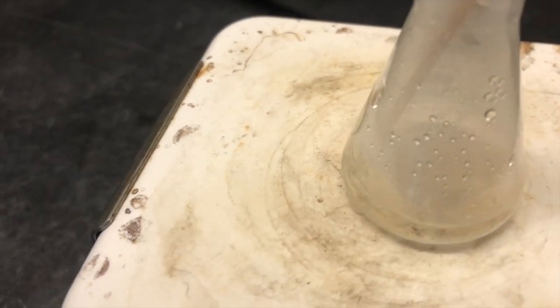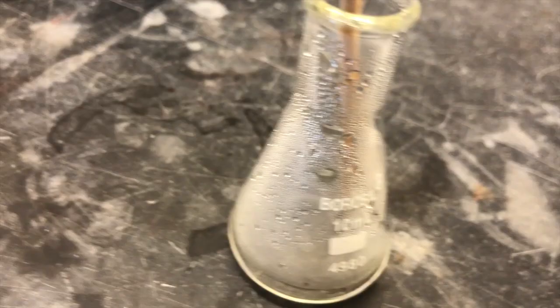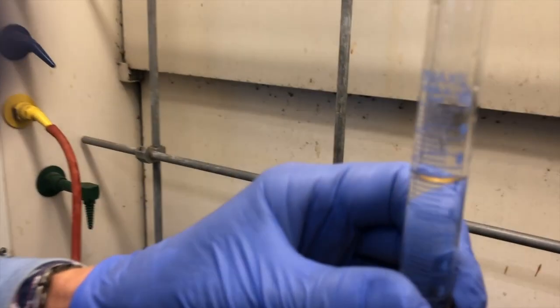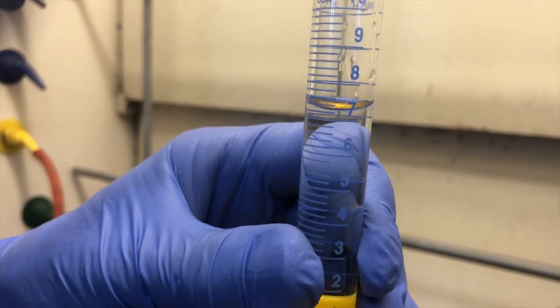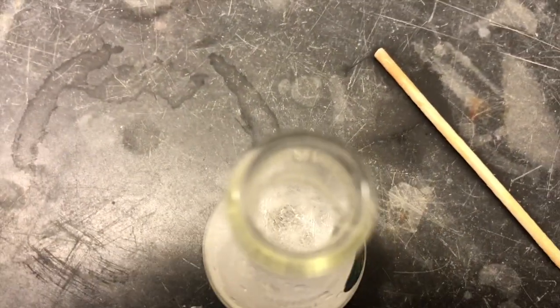Once we're sure that all of the solid has dissolved it will be safe to take it off the heat. At this point we can measure with the graduated cylinder how much water is left and determine how much water was added to this mixture. You can see this solution cooling slowly on the bench top. We remove the boiling stick and within just a few seconds the crystals begin to form.